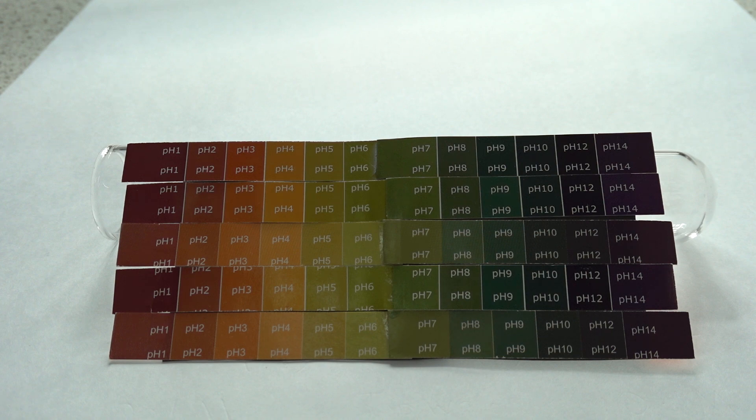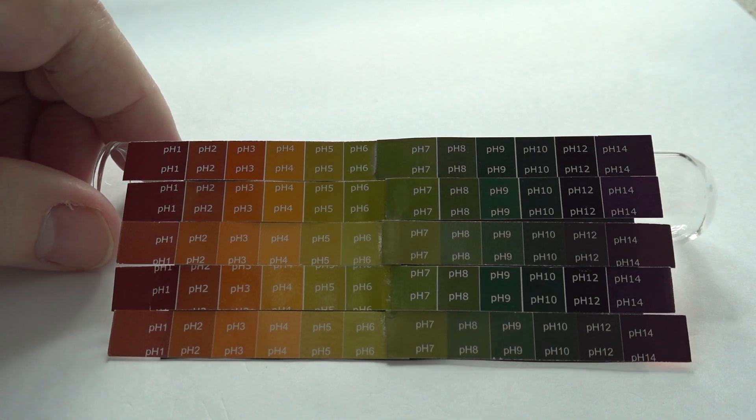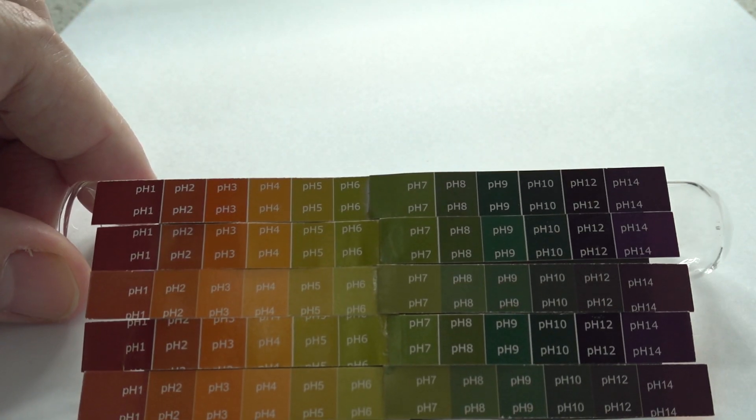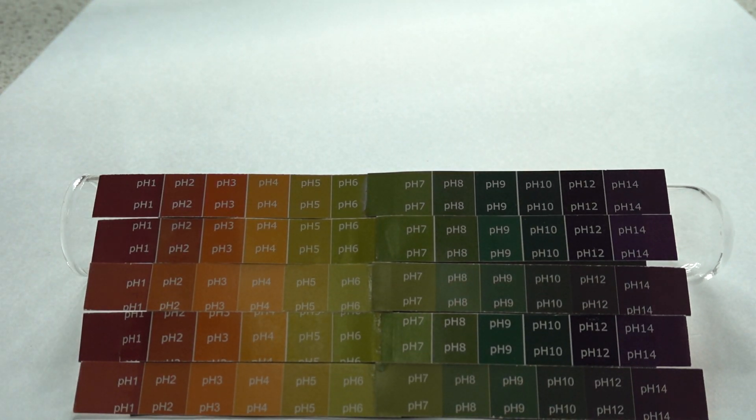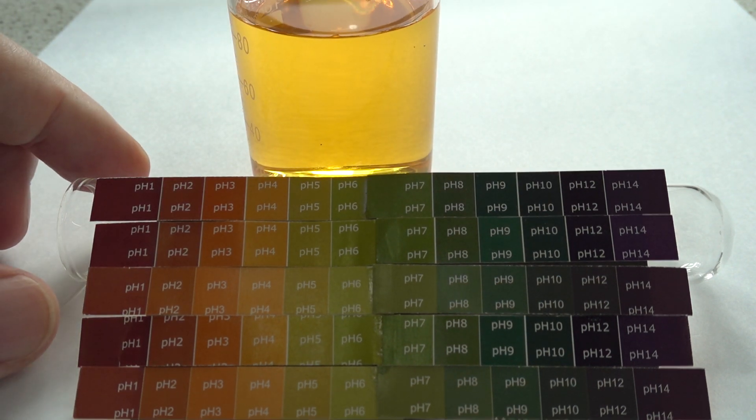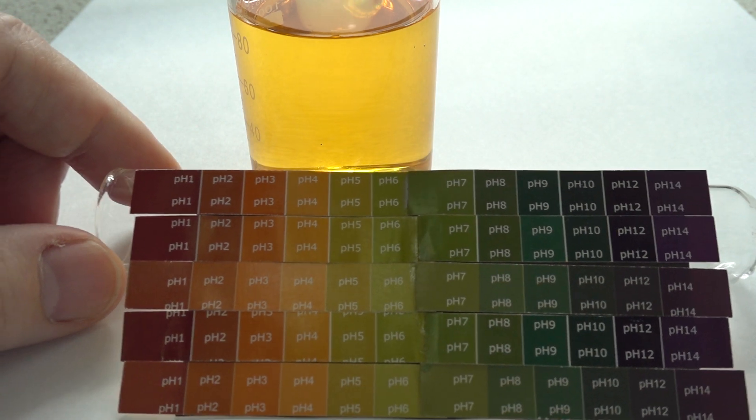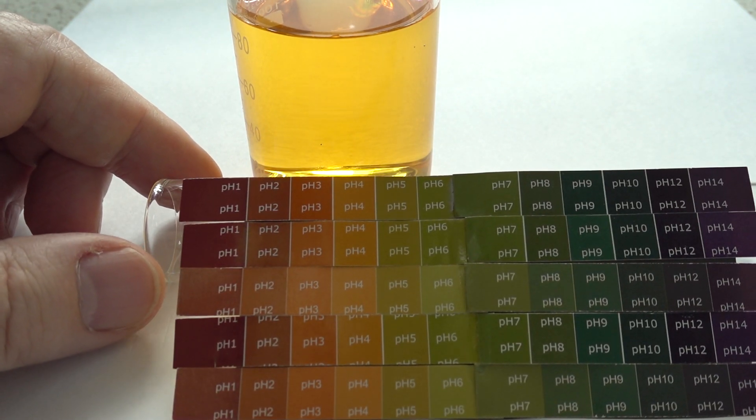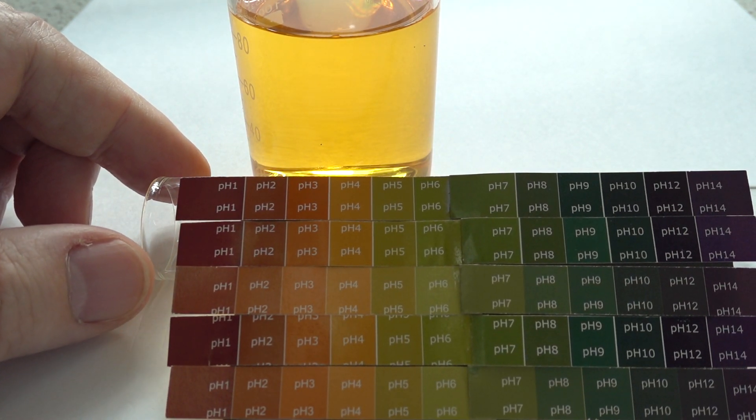So first we've got a pH scale from a commercial universal indicator. If we show a solution in the background there, the solution's clearly pale orange yellow. We might be tempted to call it around pH 4, so that's a weak acid. It's our first solution.